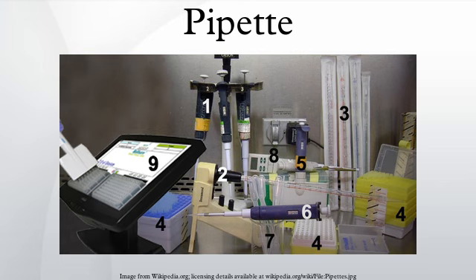Positive-displacement pipette: these are similar to air displacement pipettes, but are less commonly used and are used to avoid contamination and for volatile or viscous substances at small volumes, such as DNA. The major difference is that the disposable tip is a microsyringe, composed of a plunger which directly displaces the liquid.